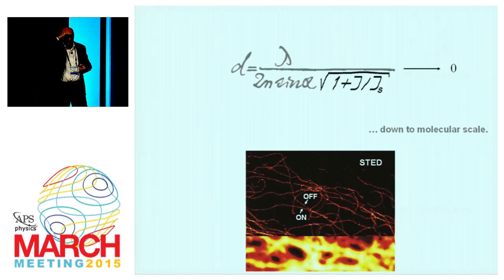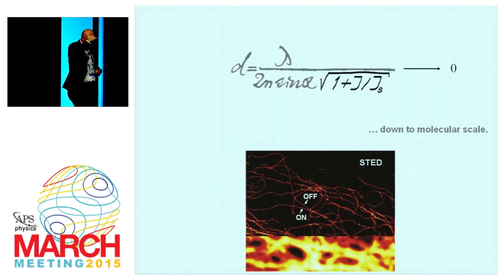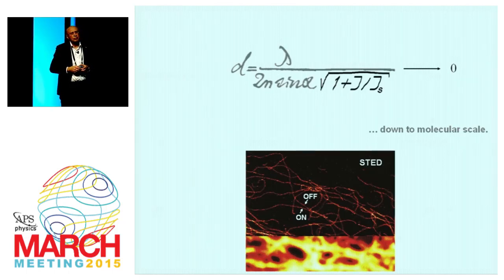One more? What limits the spatial resolution in the Z direction in STED microscopy? You showed the mechanism for limiting the spatial resolution in the transverse direction, but how about in the axial direction?